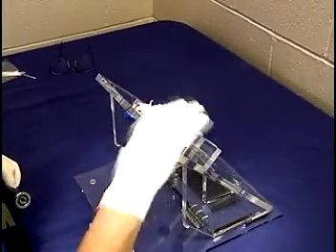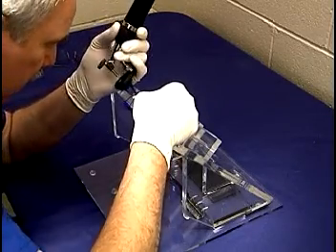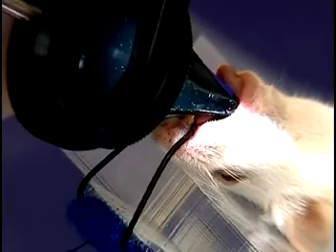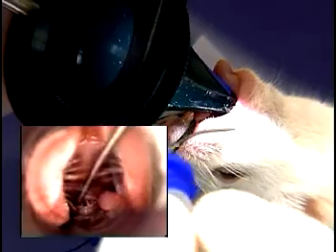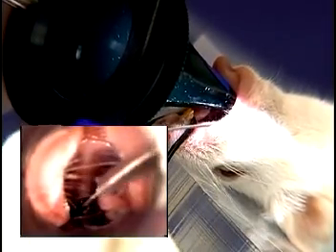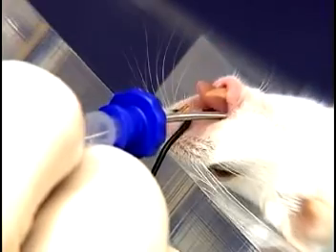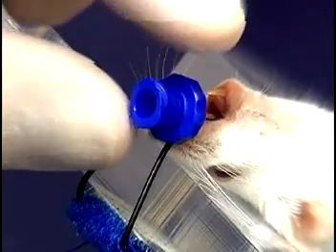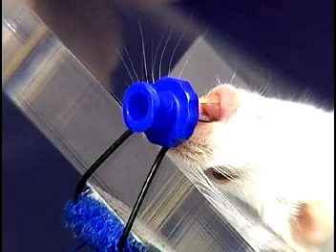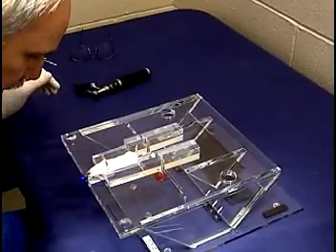The stand is returned to 45 degrees. The cords are again visualized, and the guide wire is inserted from the corner of the mouth and passed through the cords into the trachea. Be careful not to insert the guide wire beyond the thoracic inlet. The speculum is removed and the tube is advanced over the guide wire and into the trachea. Once the tube connector has reached the nose, hold the connector and immediately remove the guide wire.